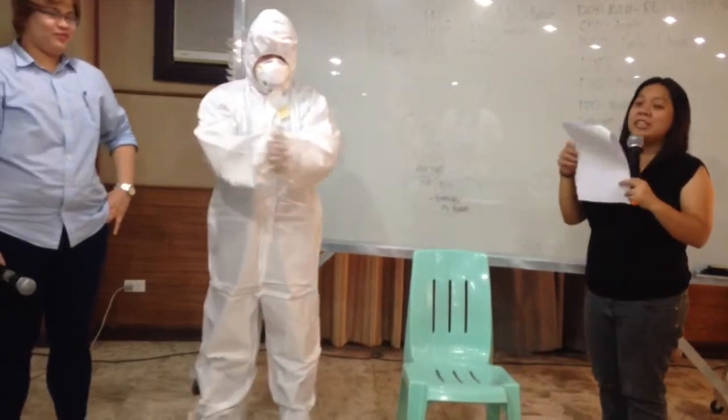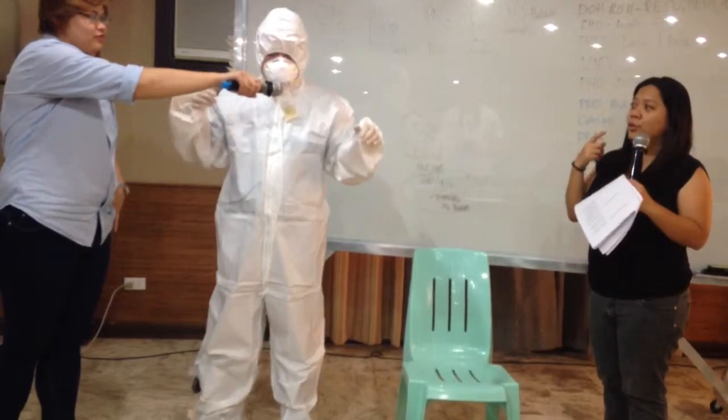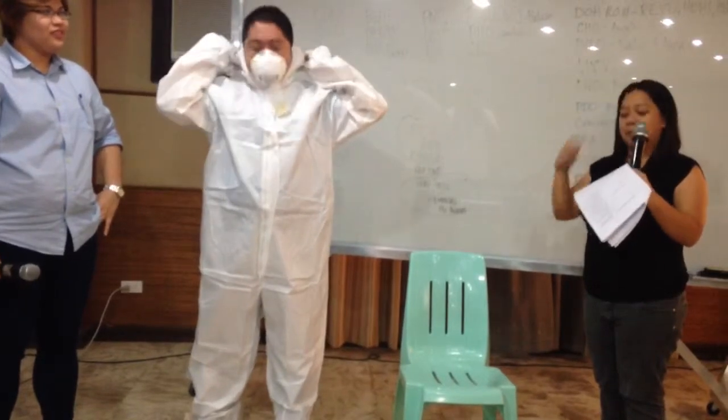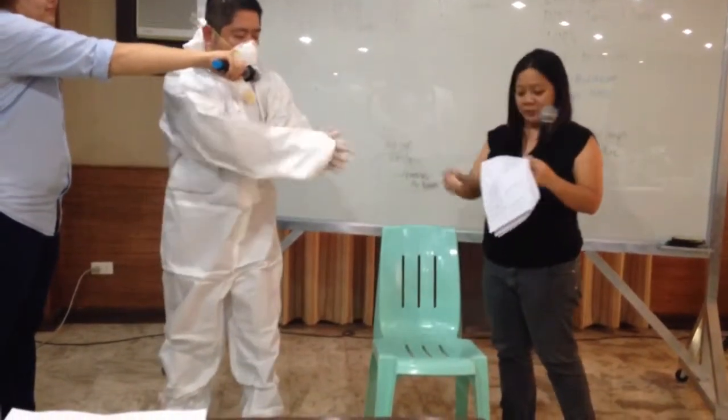After disinfecting inner gloves, remove the hood. Removing hood. When removing, just pull a little. After removing the hood, disinfect the inner gloves again. Disinfecting inner glove.